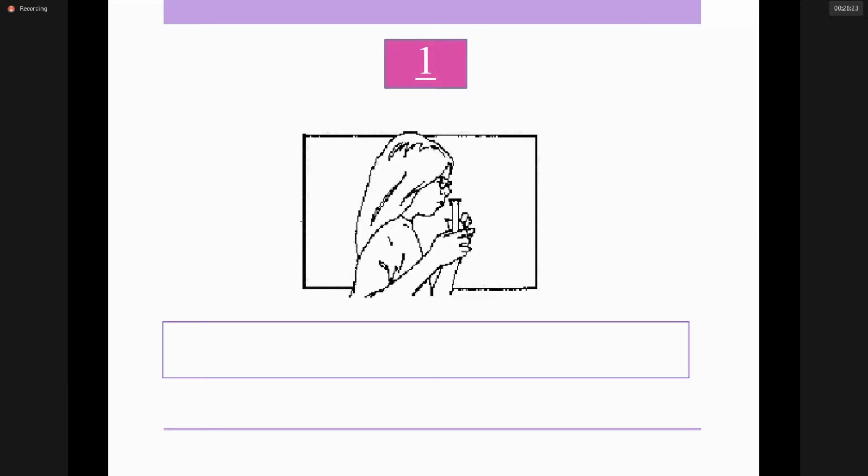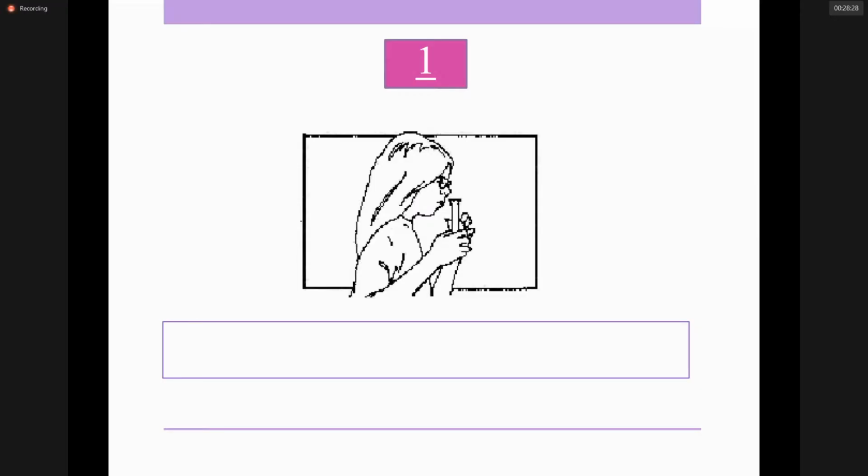What's wrong? أنا قاعد شم المادة، هذا خطر. ممتاز يا عبير. الغازات، الاكسبوجر اللي قاعد يصير هنا اللي هو الانهيليشن. So this chemist inhaled the gases, which is incorrect, and precautions وممنوع يتم التصرف بهذا الشكل في اللاب.